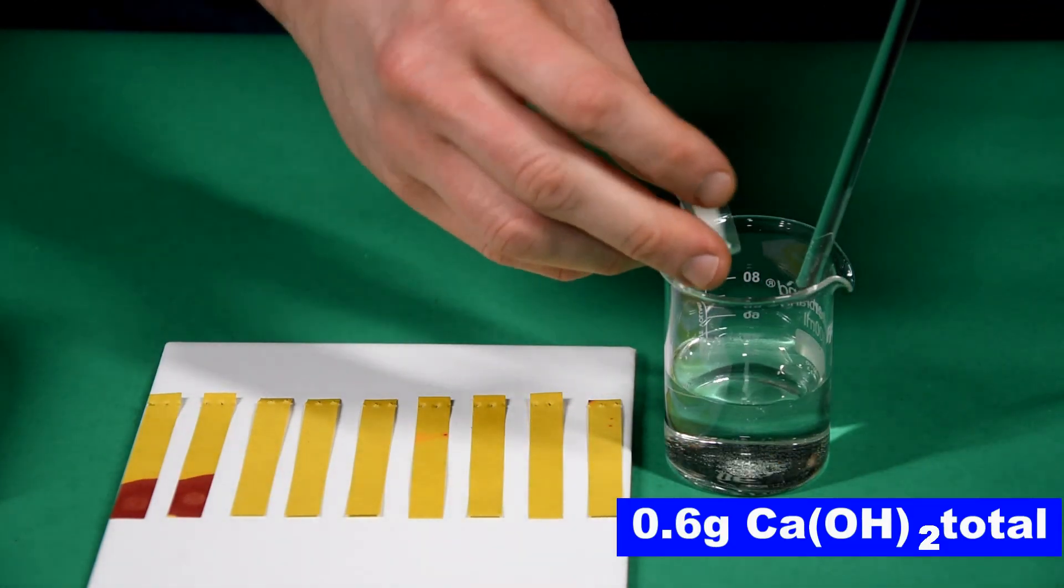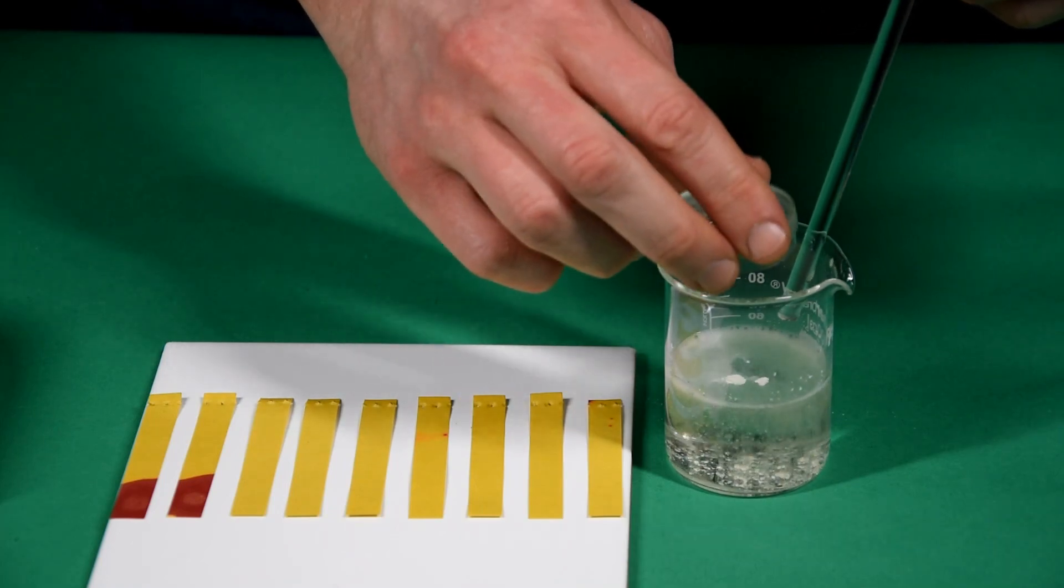The red color indicates high levels of hydrogen ions and a low pH. Now add another 0.3 grams, that's 0.6 grams in total, and then stir.